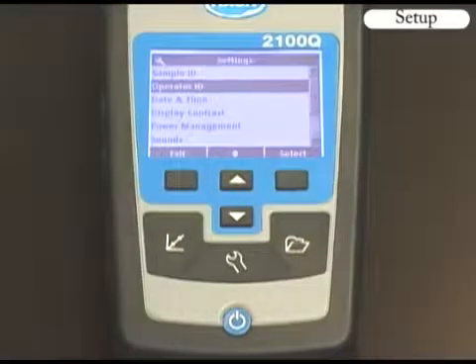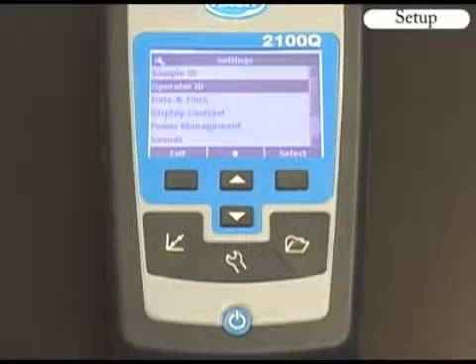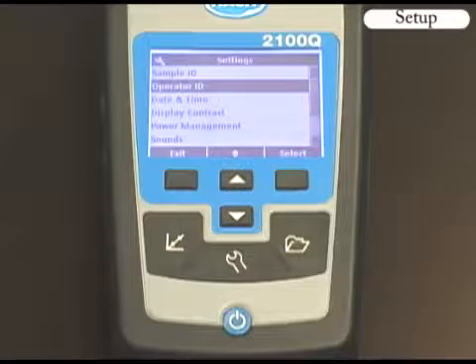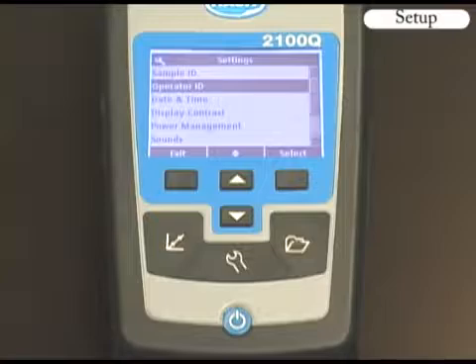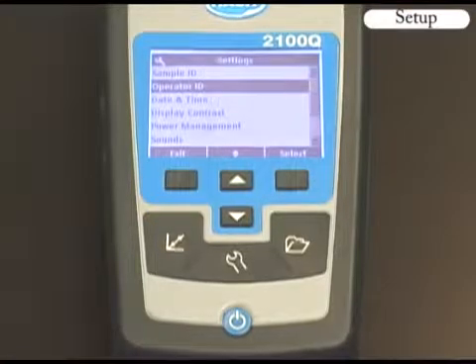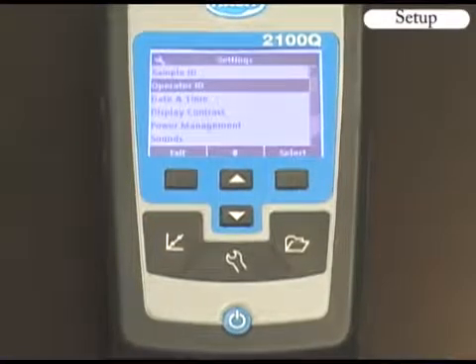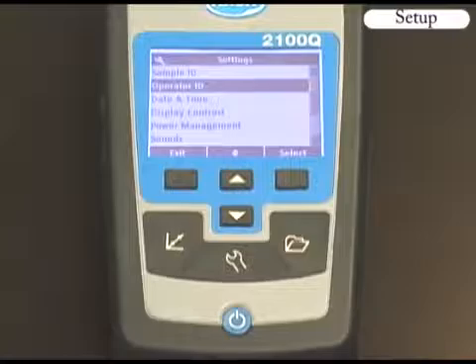There are many other possible meter settings including display contrast, power management, sound, and security. Please refer to the full user manual on CD for specific instructions.